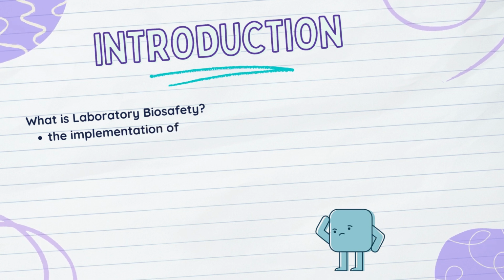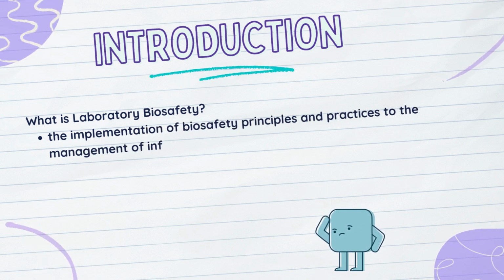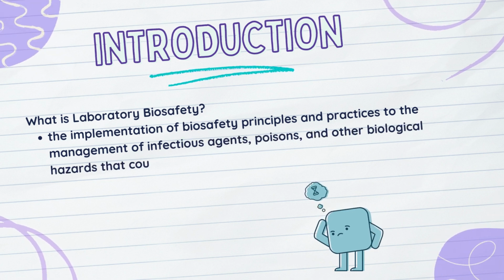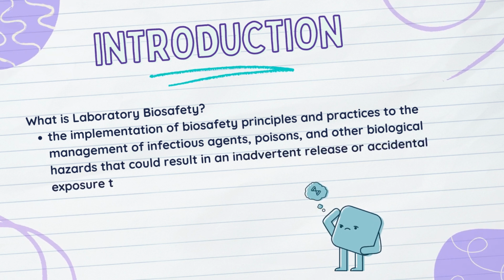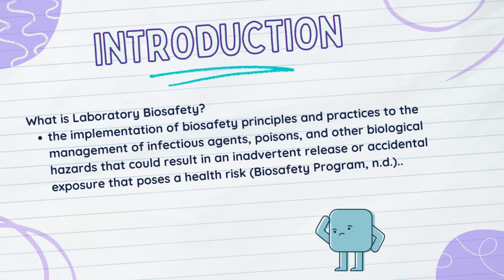What is laboratory biosafety? Laboratory biosafety is the implementation of biosafety principles and practices to the management of infectious agents, poisons, and other biological hazards that could result in inadvertent release or accidental exposure that poses a health risk.